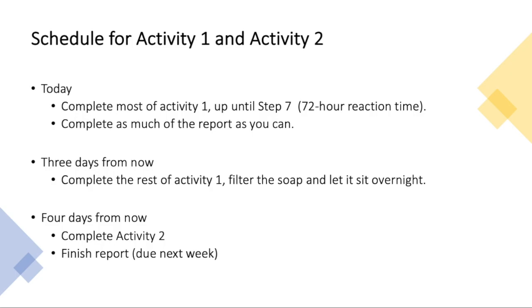One of the things we want you to be aware of for this lab is that it's going to take place over several days. So in class today, you'll do most of activity 1 up until step 7. And then in a few days, you'll complete the rest of activity 1, and then you need to wait another day before you do activity 2. So you should be able to accomplish all of this before we meet again next week, and the report will be due then. Also today during class, you're going to be doing 3 lab skills that you'll use during this experiment.